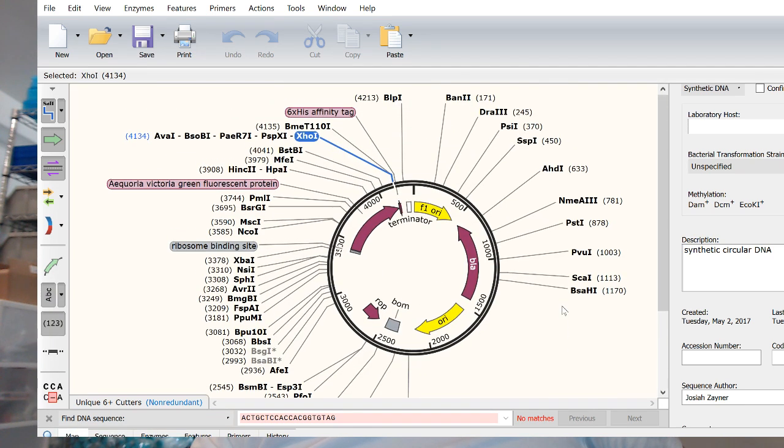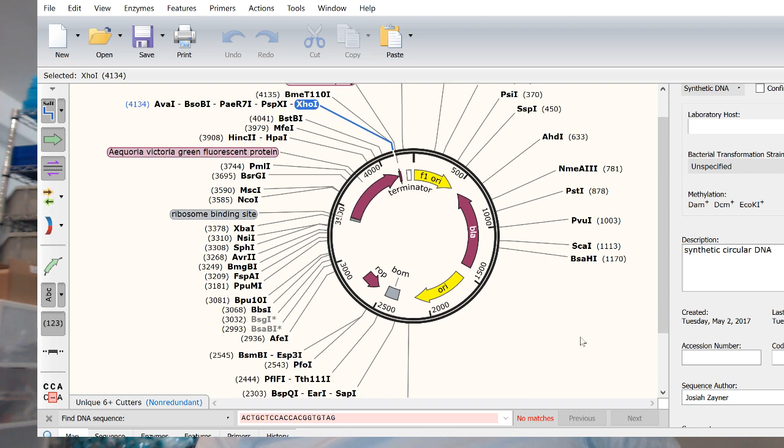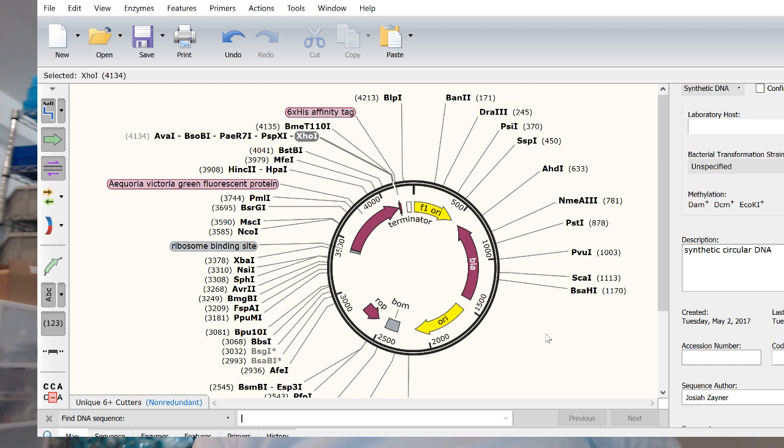And you should see something like this. This is what we're going to look at. So get SnapGene, get it open, and load this up. Okay? So this is what they call a plasmid map. This is a representation and a map of all the different pieces of DNA that are in a plasmid. And they all do different things, right? So this plasmid, all plasmids, have three main parts.